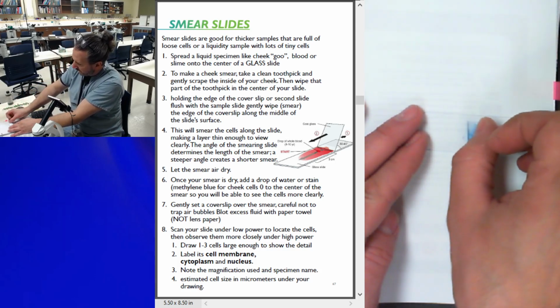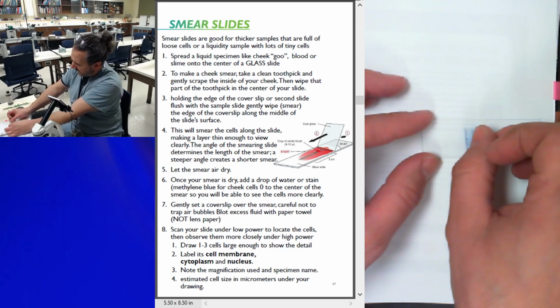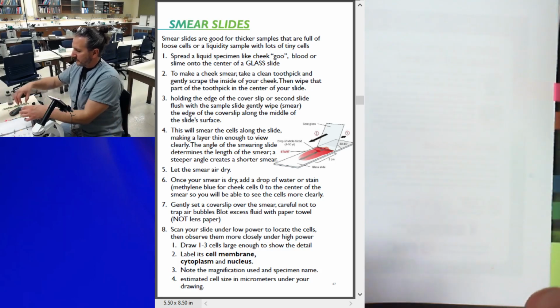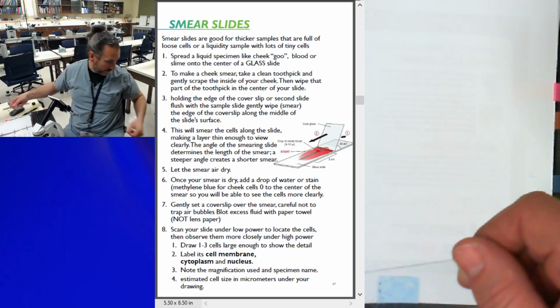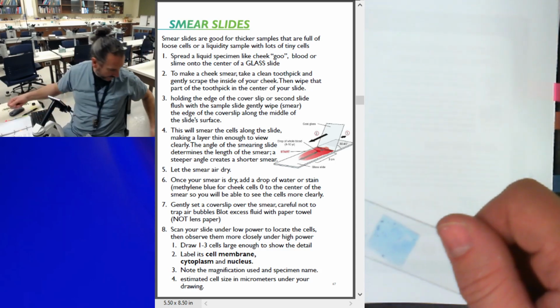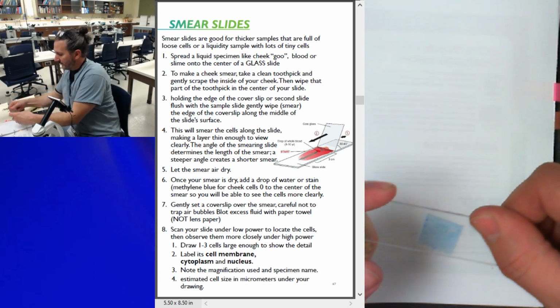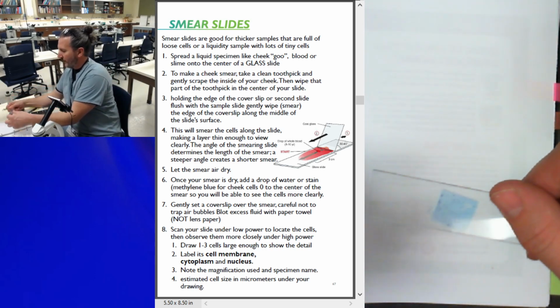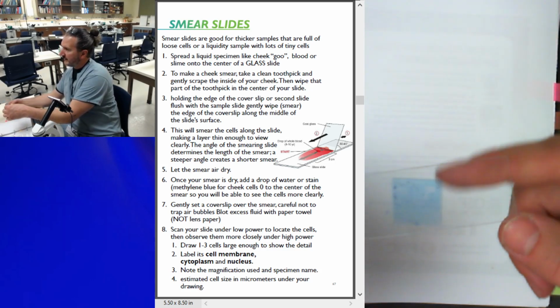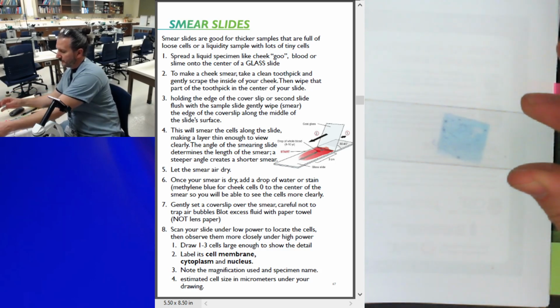Alright, now, one thing I could do, and I would not do this unless you had adult supervision, but you could actually take that, hold it with your tweezers, or put it in something safe like the edge of cork, or with a hot holder, and put a lighter underneath it or a match and kind of heat that up, and it'll dry out your biofilm.